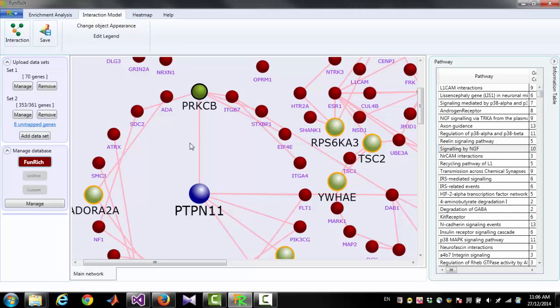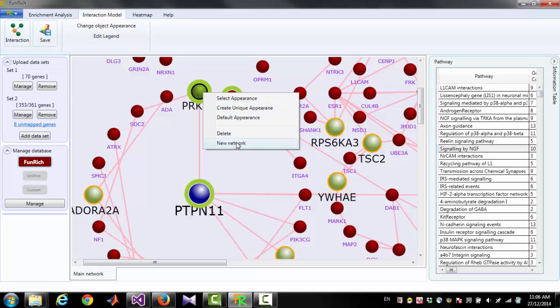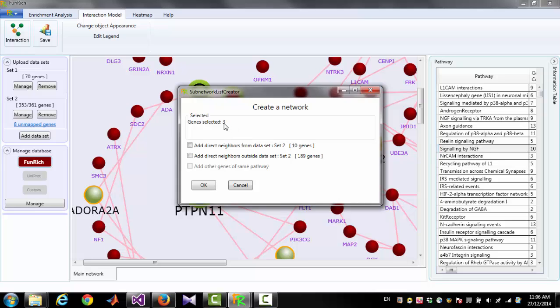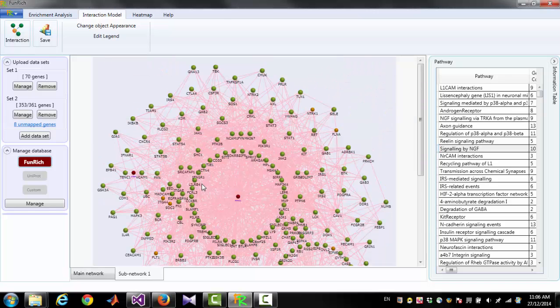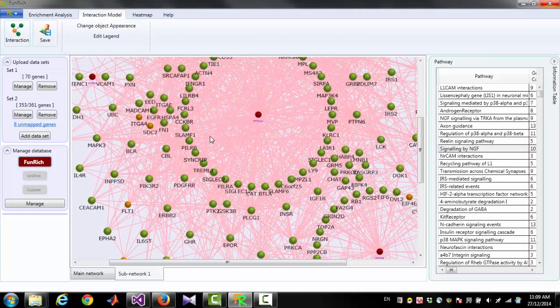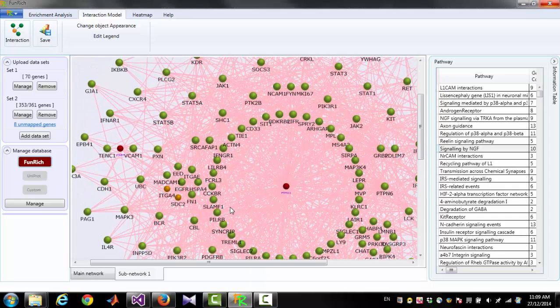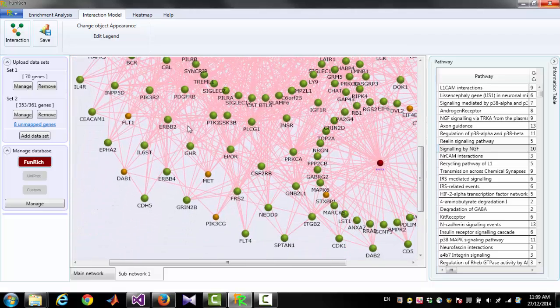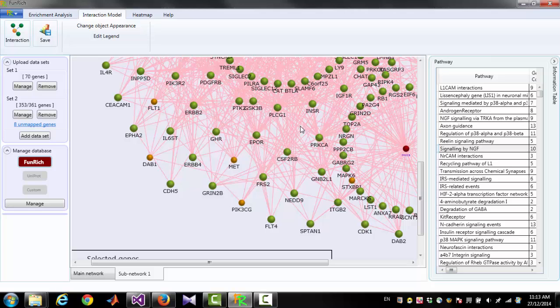You can also create an interaction diagram for selected nodes. First select several nodes and then click 'New Network' — this will generate an interaction network for the selected nodes. You can also add other nodes that have interactions with these selected nodes from your data set or outside your data set.